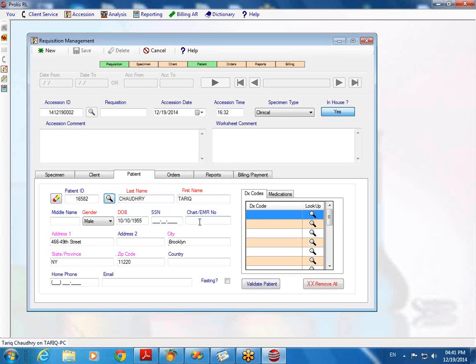Sorry, moving on from that, I just had a thought. Does the system have the capability to let us check out a sample?